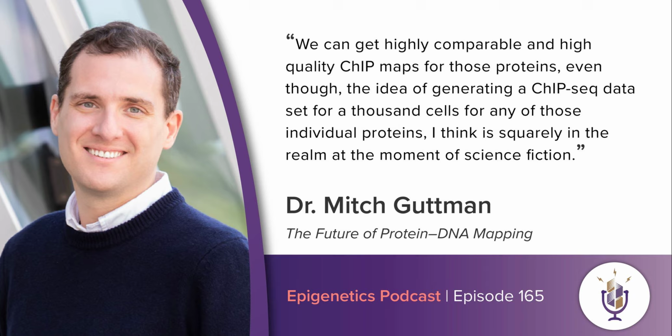And that's prime. Okay, so certainly there are probably some antibodies where that could be helpful. We haven't found that to be necessary for most antibodies we've tested, and we haven't done it primarily because when we don't need it, that of course can potentially introduce other sorts of background issues into the procedure. But the potential for chromatin to dissociate and rebind, of course, is problematic. I mean, for all assays, but particularly for an assay like ChIP-dip, because in a normal ChIP, if chromatin dissociates and then rebinds to the same antibody on bead, it doesn't really matter because you're still pulling it down.